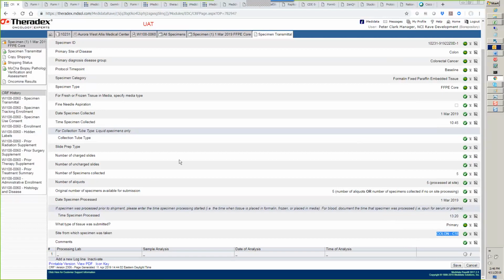This form is important because it contains some fields that labs would need to fill out. Whether it's Michelle's lab at Hopkins or the MOCA lab or even the biorepository, the lab personnel has access to this set of the form.